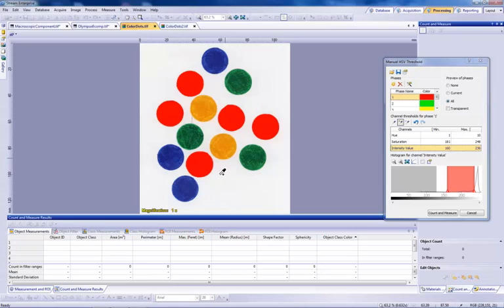Once we have the entire range of red color phase selected to now see the entire red area covered with the red threshold, we can right-click to end the add-on dropper selection. Now we need to select the second phase, which is green. Using the same method, we will select New Threshold Dropper icon. Select the green color range.